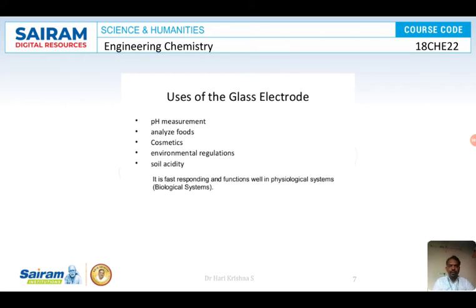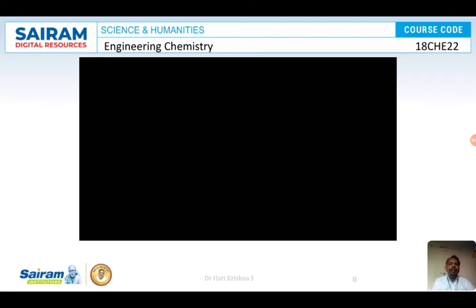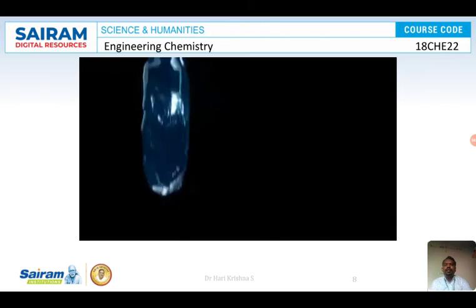There is a small video here which shows the ion exchange reaction which occurs, which I showed you. So how it occurs and how sensitive the glass membrane is, you can see over here in this reaction.